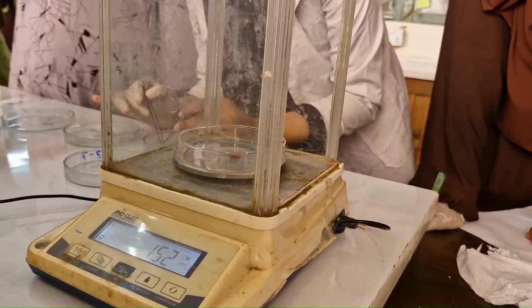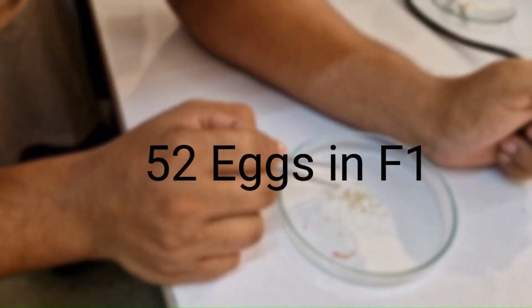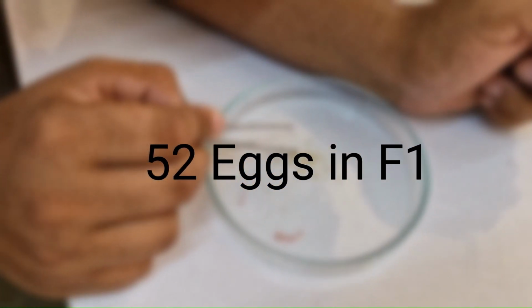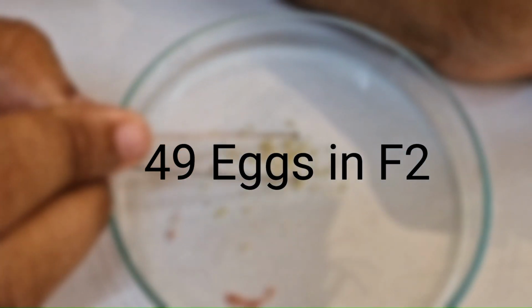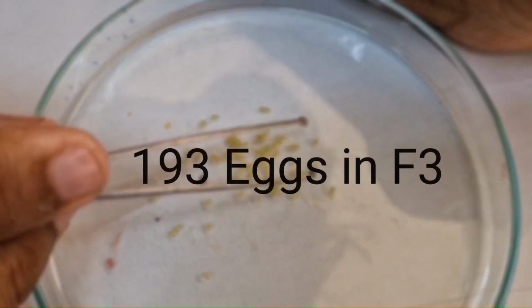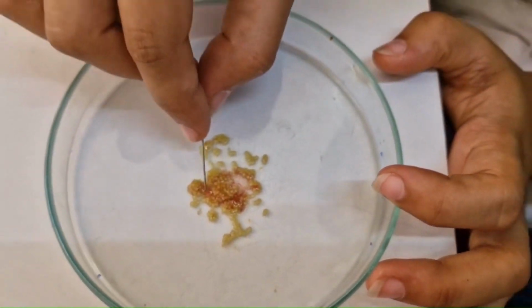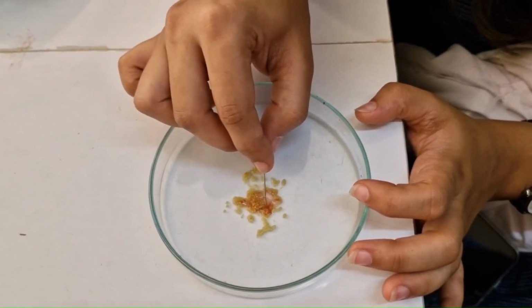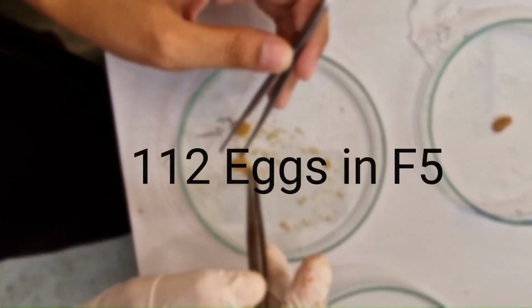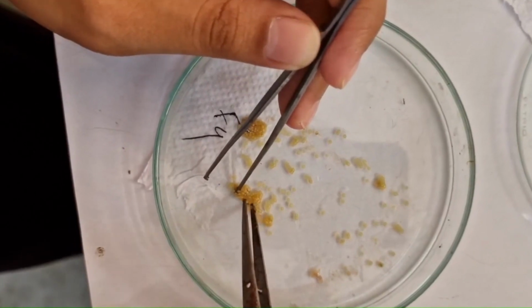Then we counted the number of eggs from each subsample. In F1 we found 52 eggs. In F2 we found 49 eggs. In F3 we found 193 eggs. In F4 we found 247 eggs. In F5 we found 112 eggs. And in F6 we found 99 eggs.